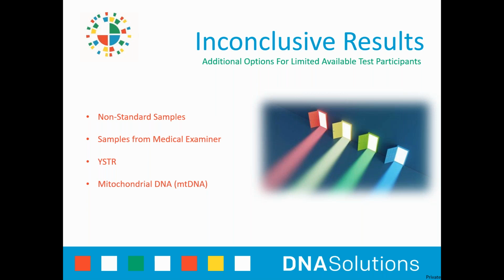If it's an informational test and you don't need it to go to court, we may be able to get DNA from a personal item, such as a toothbrush or razor. Please do contact us if you have that, or if you have something really out of the ordinary. We can give you an idea of how best to preserve it and ship it, and how likely it is to work. Cremated remains, absolutely no chance it's going to work. Toothbrushes nearly always work, although occasionally we get a mixture. Surprising how many people's toothbrushes have more than one person's DNA on them.